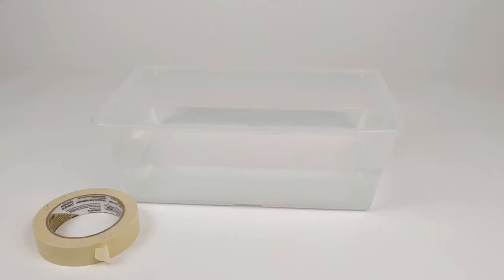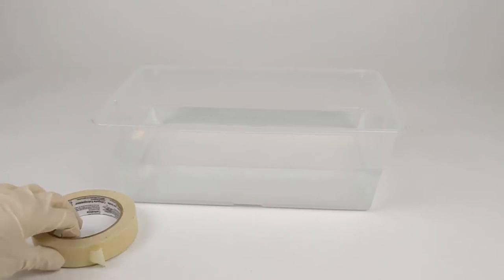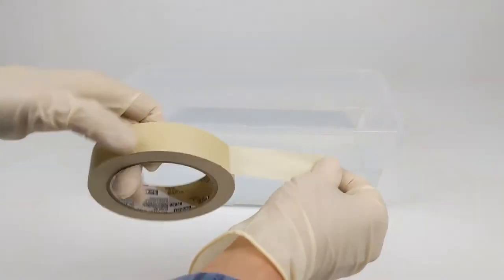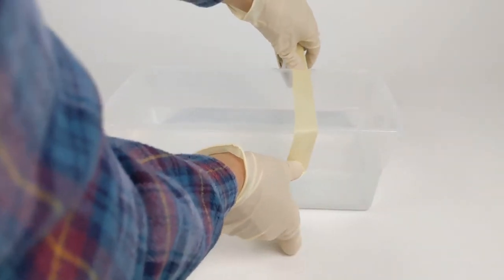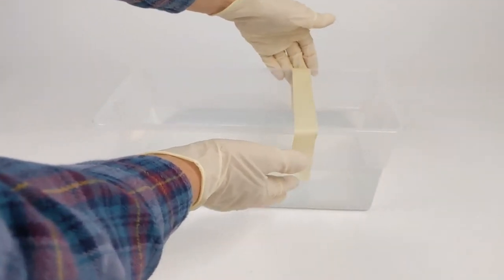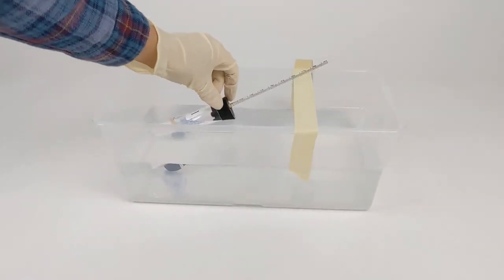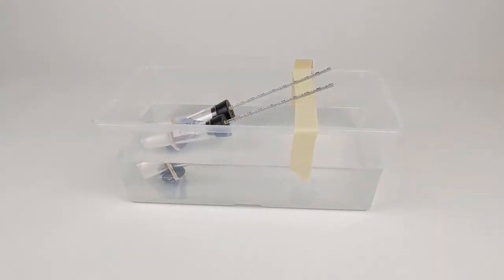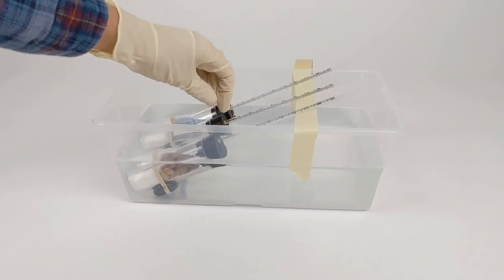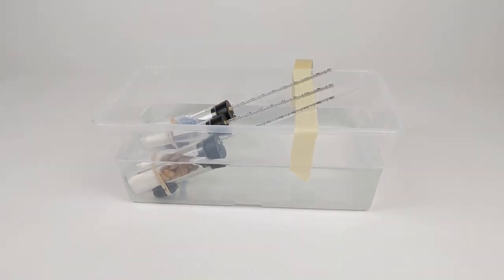Now we're going to place the assembled respirometers into a room temperature water bath. First, we're going to put a masking tape sling across the water bath to hold the pipettes out of the water while the vials are submerged. Now we'll just place each vial into the water. These vials will remain in the water bath for seven minutes.